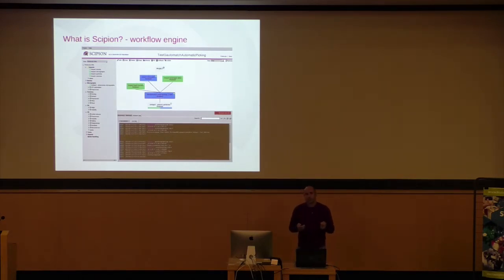It's software that allows you to plug in components and do one step after the other, and each step is a process, something you want to do with some data. It's thought of as a generic tool, not only for Cryo-EM, but since it started with Cryo-EM, everything available in Scipion now is Cryo-EM stuff.